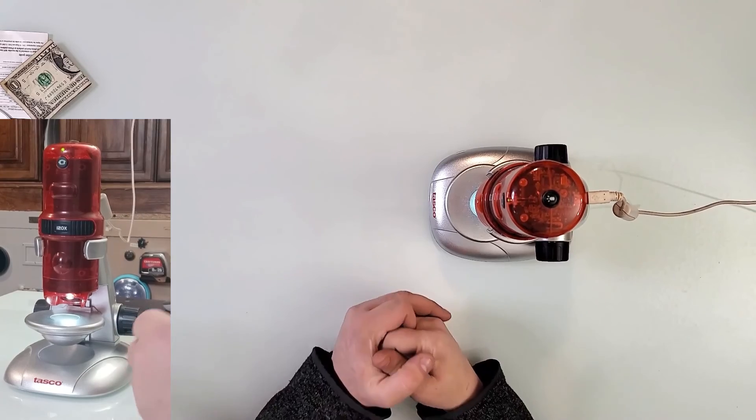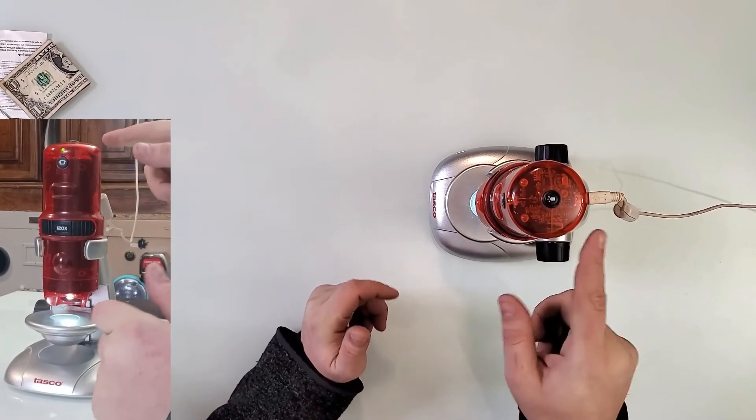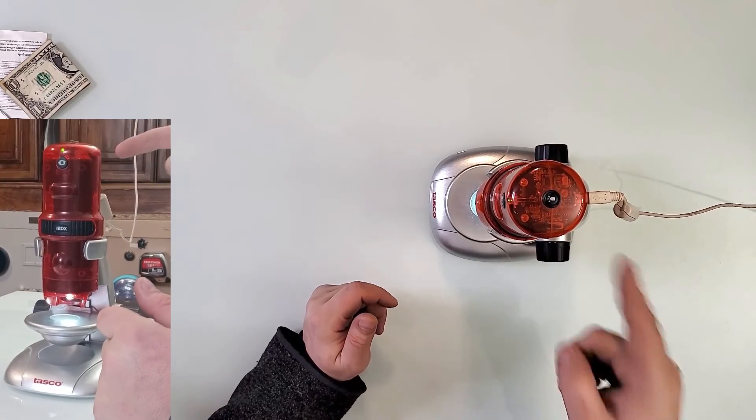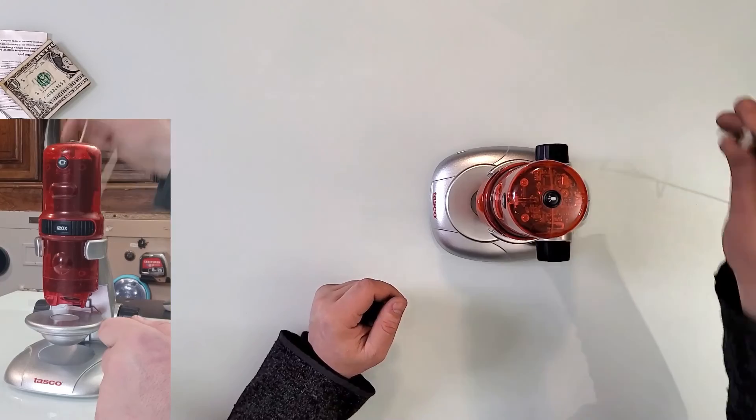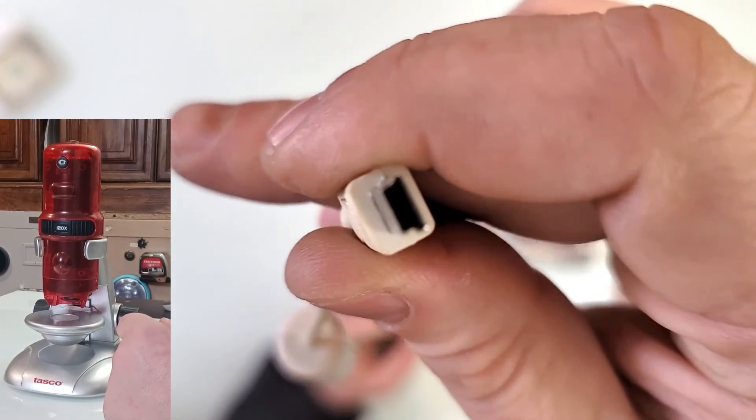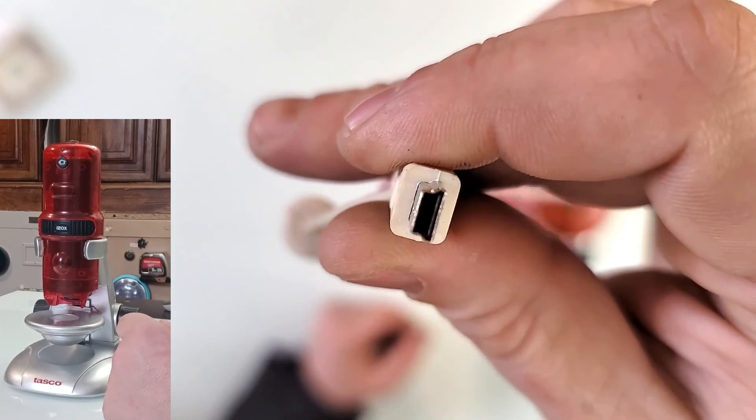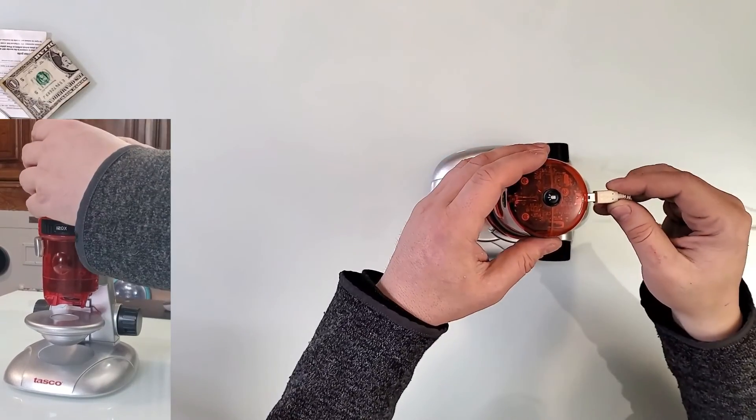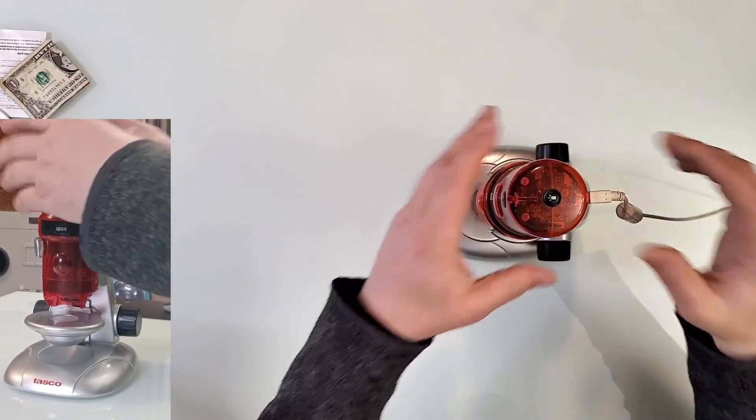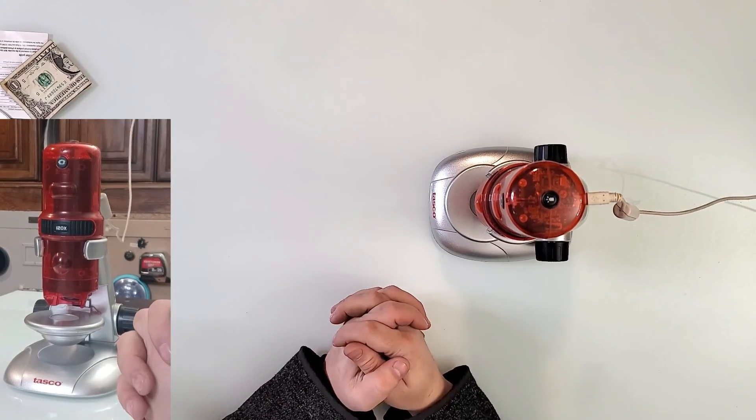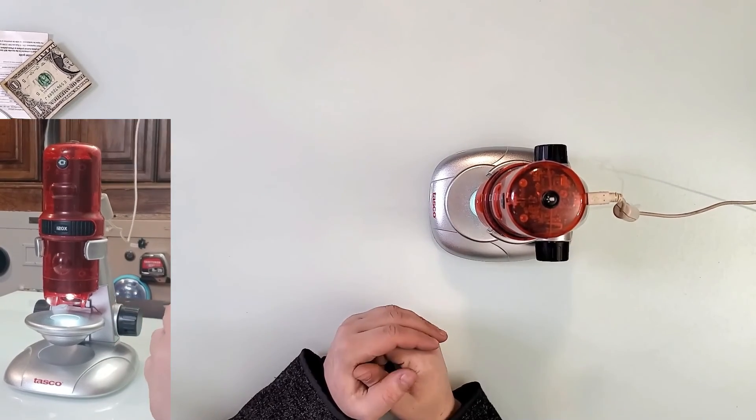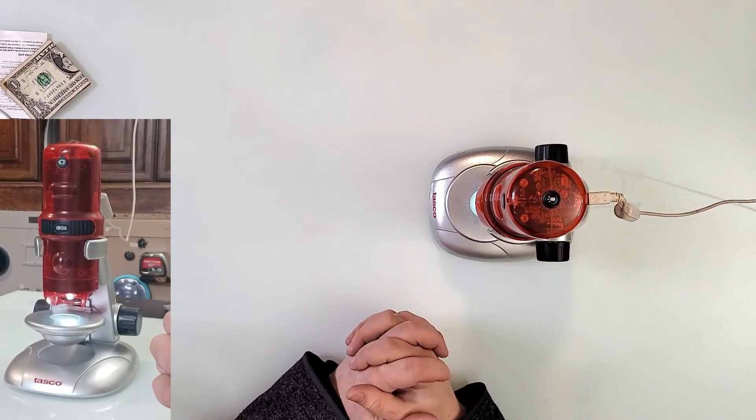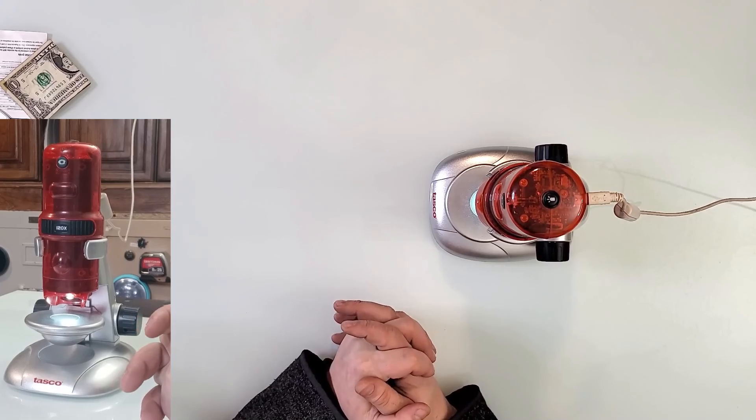And it's portable. It's just powered by this tiny USB. It's a mini USB that you might have from older devices. And that's all. That is all it is to this Avio Cheetah 3 microscope that you can install on yourself.